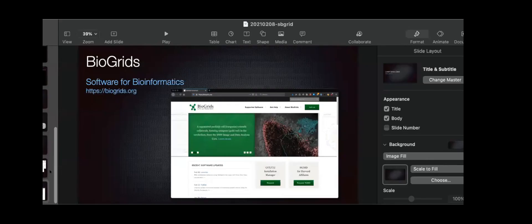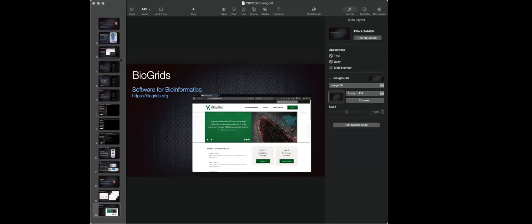One thing to note: tools that are shared between BioGrid and SBGrid are actually the same installation, so it doesn't double your disk size. The SBGrid and BioGrid stacks sit in the same space and overlap to some degree. Core tools like Python are shared, while something like nanodoc here is purely a BioGrid title.